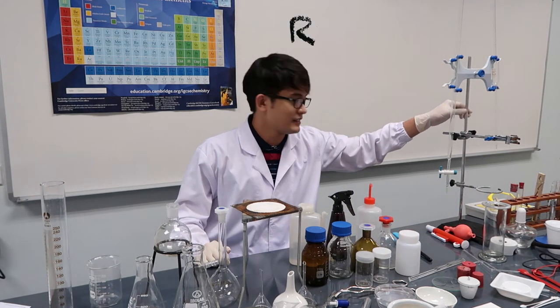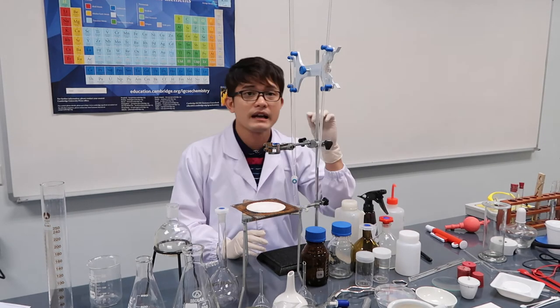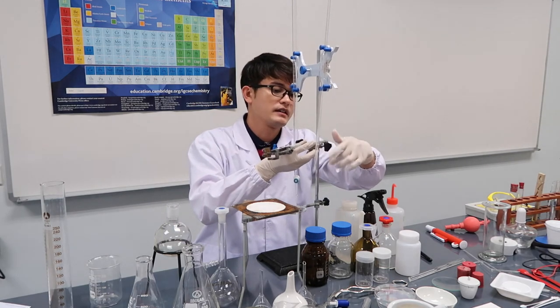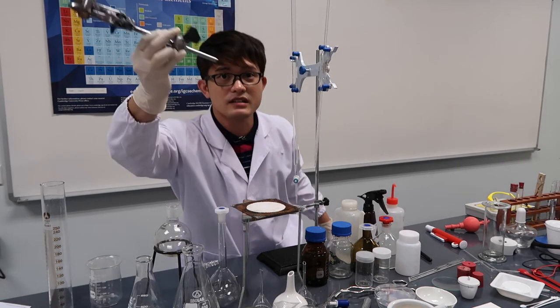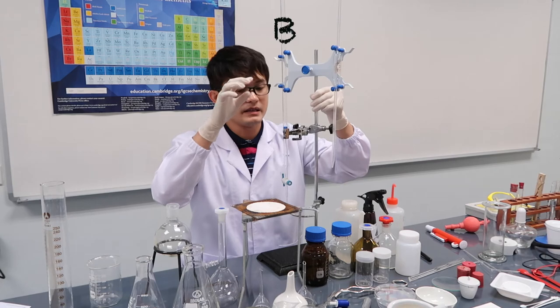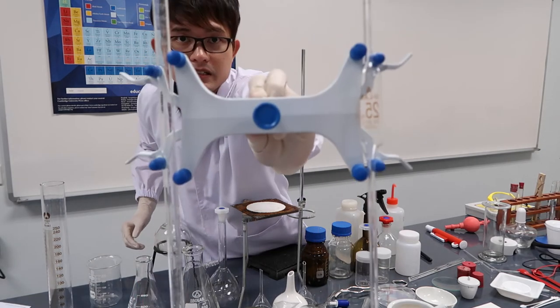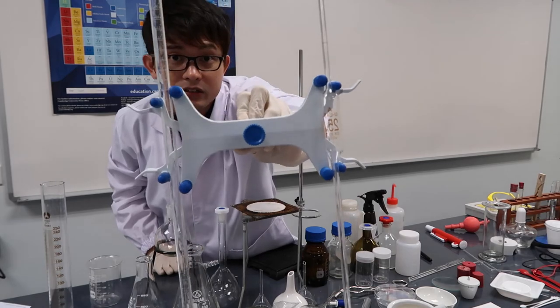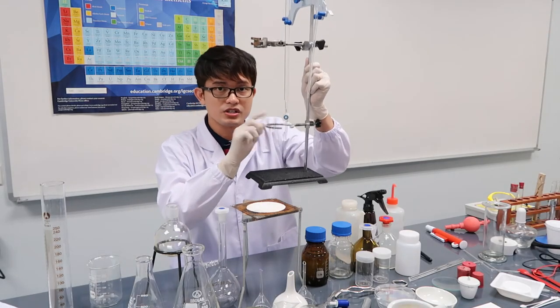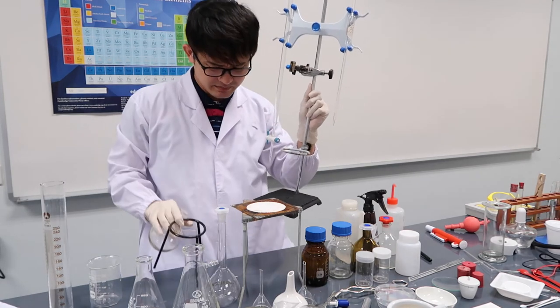This is a retort stand, used for major support for clamps. This is a boss clamp — used to secure your glasswares so they don't move. This is a burette clamp, which holds the burette. Its partner is the volumetric pipet. And this is the ring with boss — a tripod ring shape used for supporting equipment during heating.